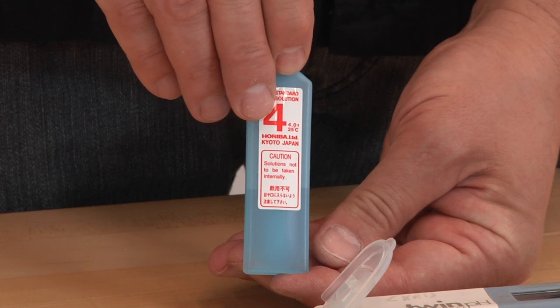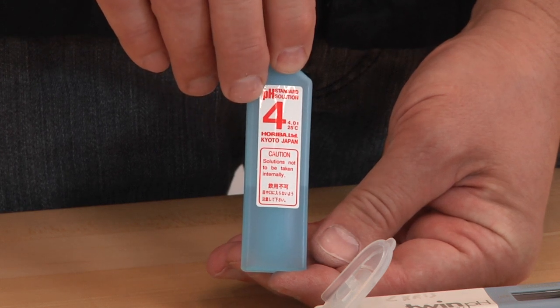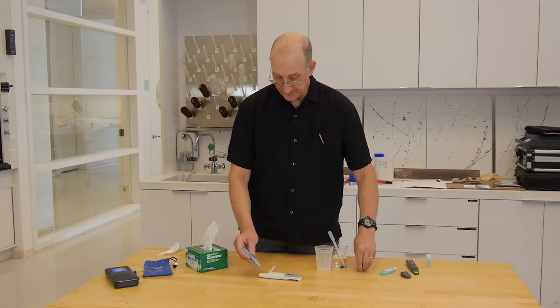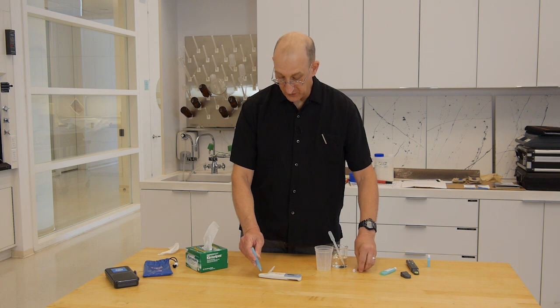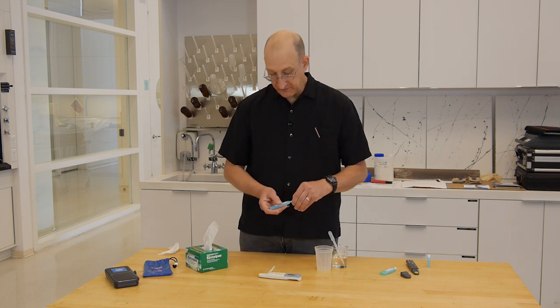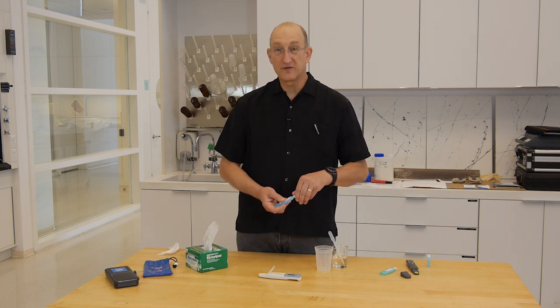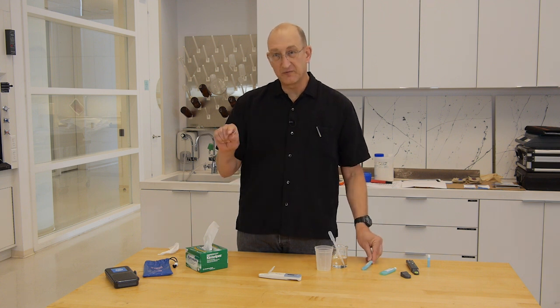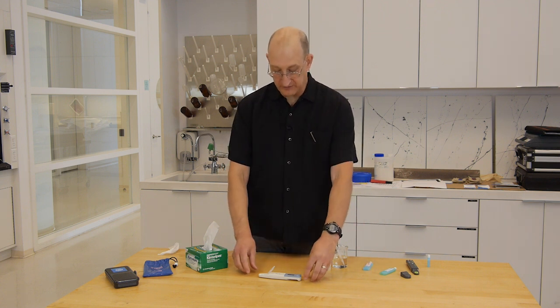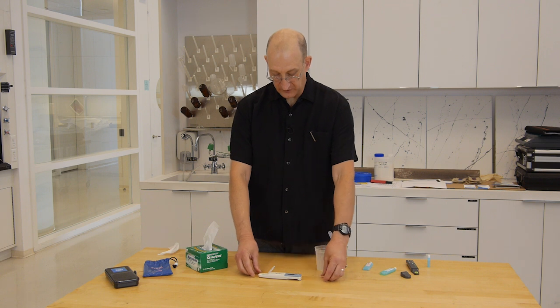Now we want to calibrate at pH 4. Use the pH 4 buffer solution. Again, fill the sample well. Make sure we have both the measuring and reference electrode dampened, and we have both in contact with liquid. The liquid is consistently across.